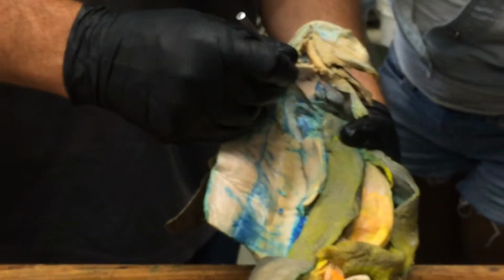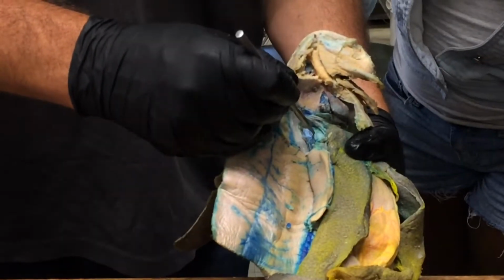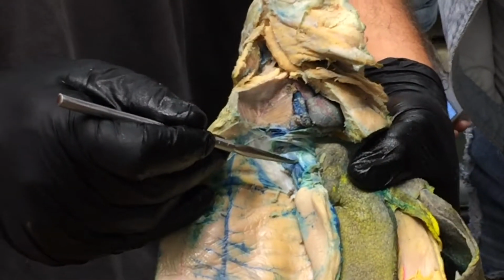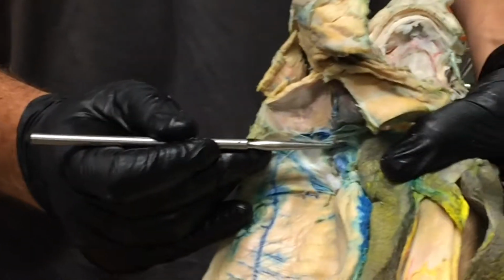In this mesentery, do you see this tube running along right there? That is a remnant of the oviduct in a male shark. You see that right there?